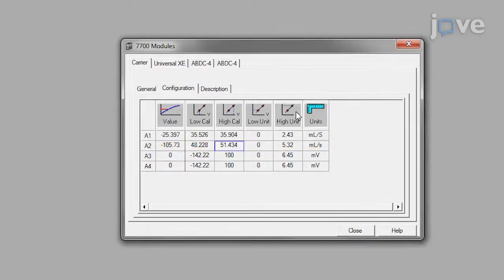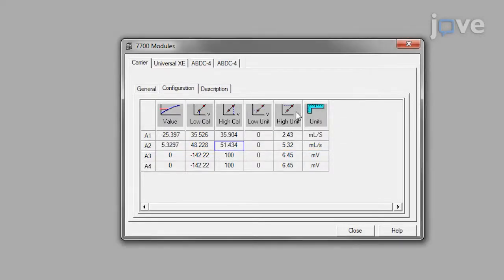Then leave the 7700 amplifier setup tab open to calibrate the metabolic analyzers to the barometric plethysmography software.